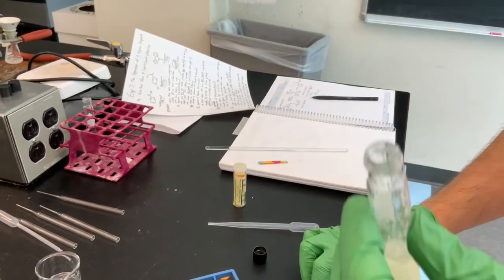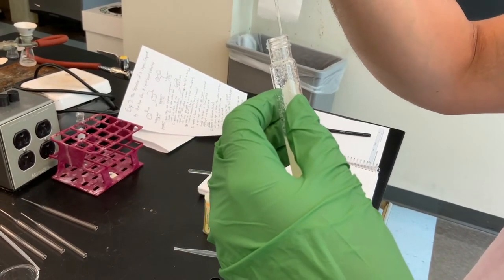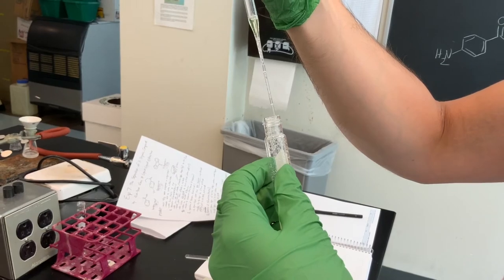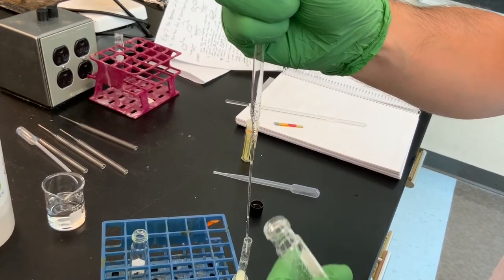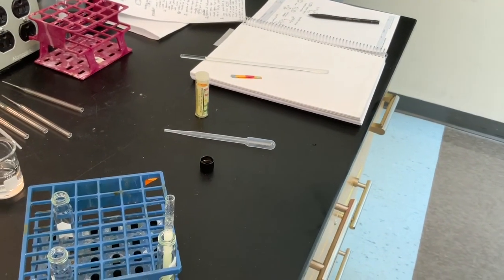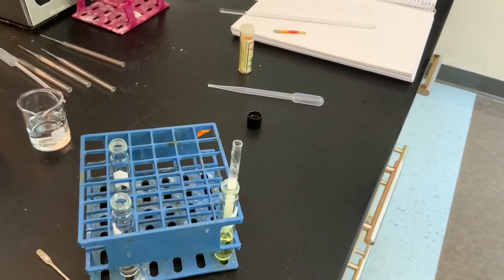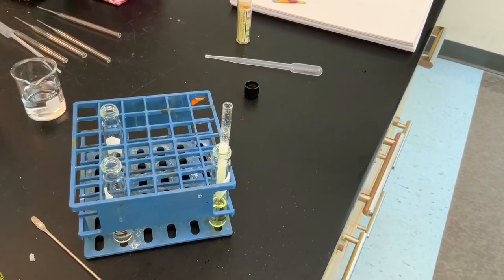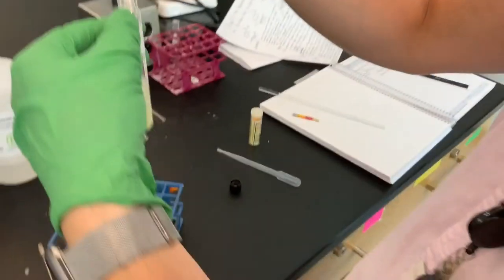All right, so that's moving around a little bit better now. Pipette is also choking. So this is really testing my patience. Do I want the remaining in there? I mean, the color is very apparent still, but it might be micrograms at this point. This will be the last round.